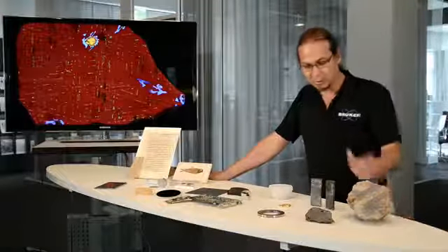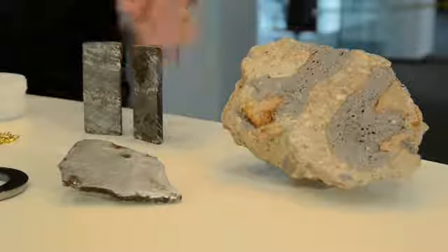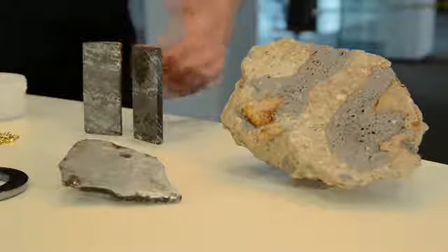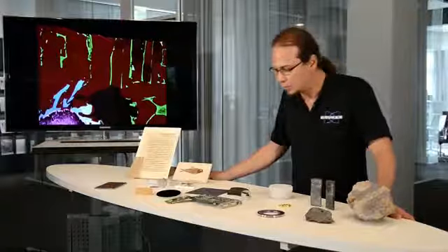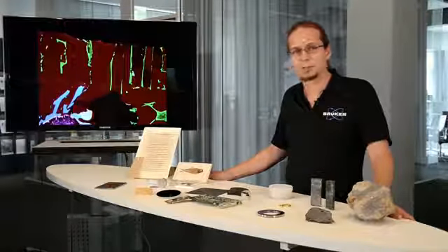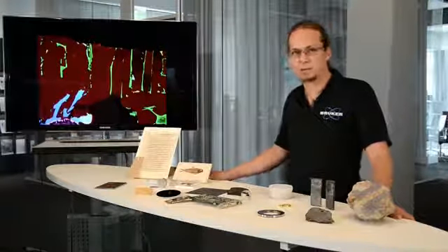You have the possibility to determine, like in these drill cores, what are the proportion of the different mineral phases within this drill core sample. One interesting thing of micro-XRF is that you not just get information of the elements in the top layers of the sample but also from the depth. Depending on the material you can get to micrometers or millimeters inside of your sample.